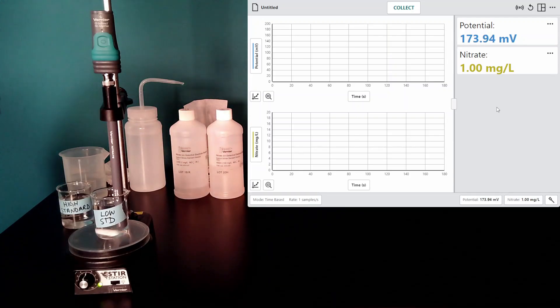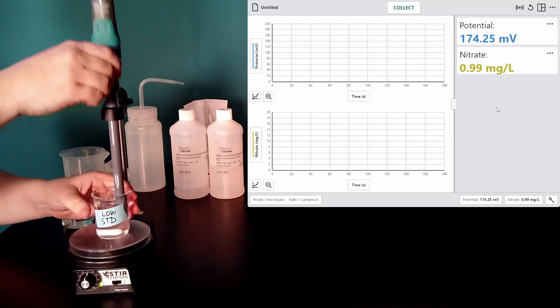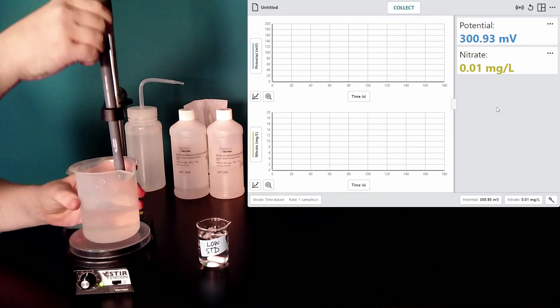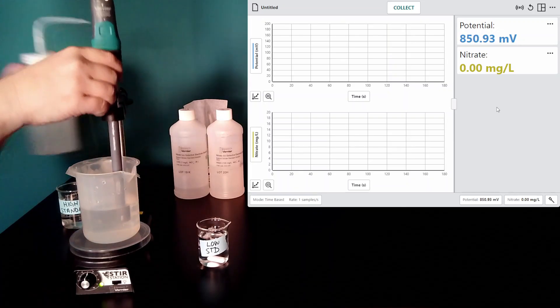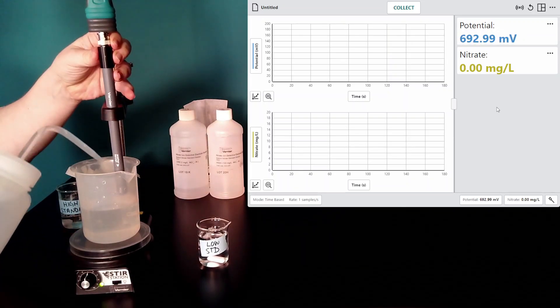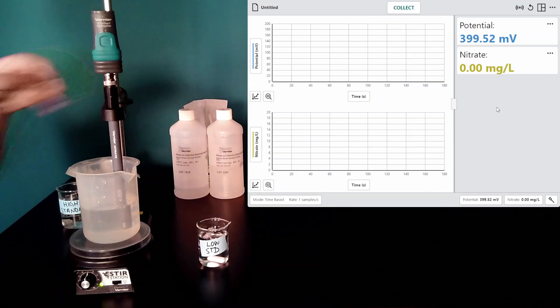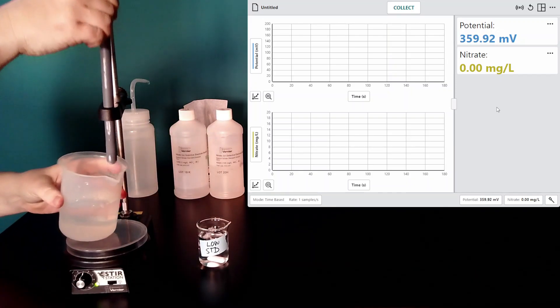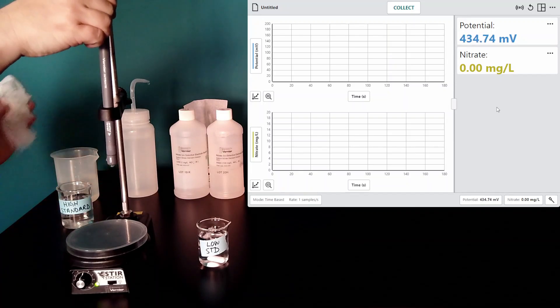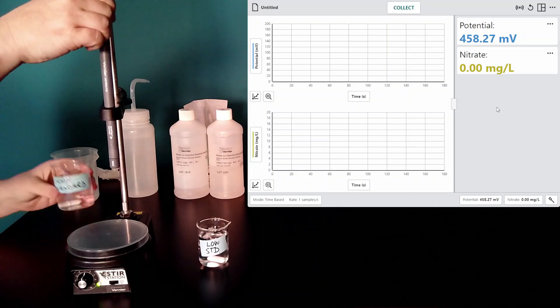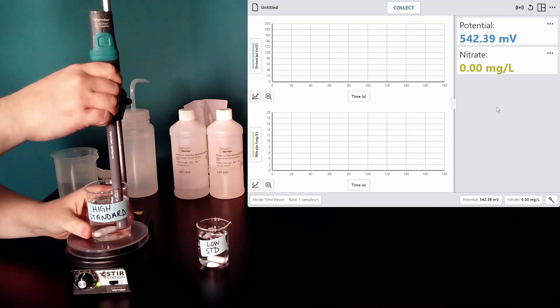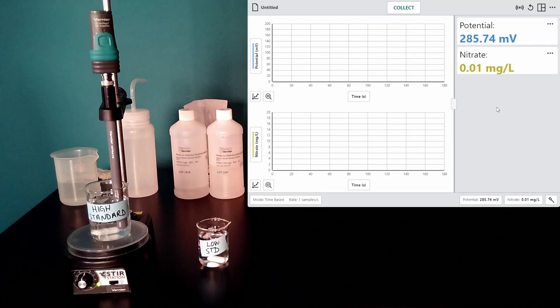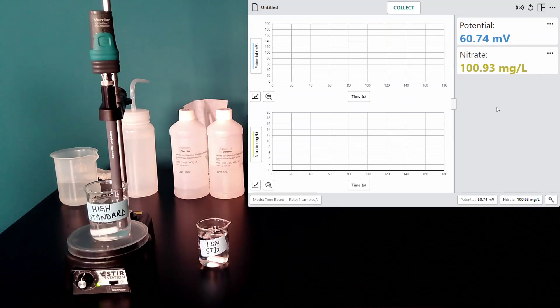Let's go back and check our high standard. See if it is reading closer to 100. And it is.